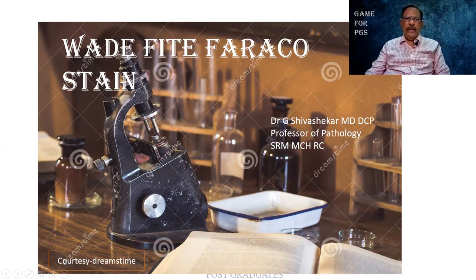The topic for today will be the Wade-Fite-Faraco stain. In the last class, we had seen the PAS staining. Here, I thought it was a very simple procedure, not much to talk about. Then as I did a little bit of homework, I found that there are certain things which we shall understand and reproduce.